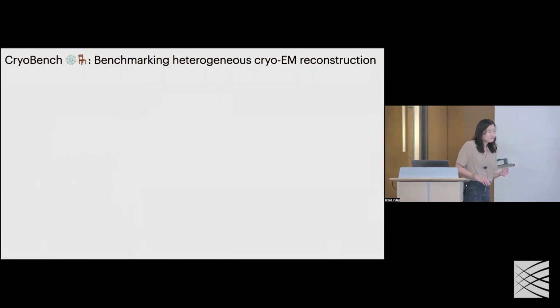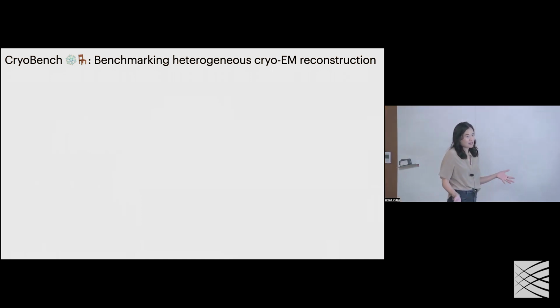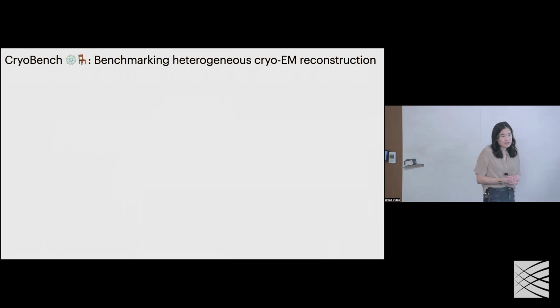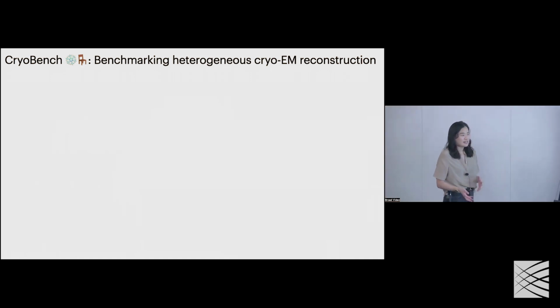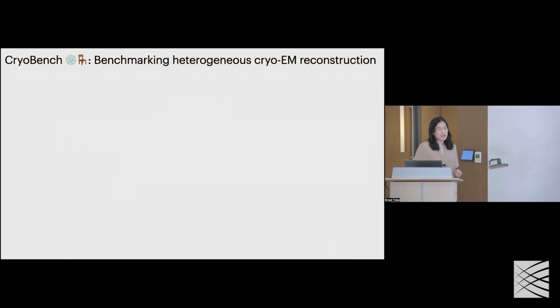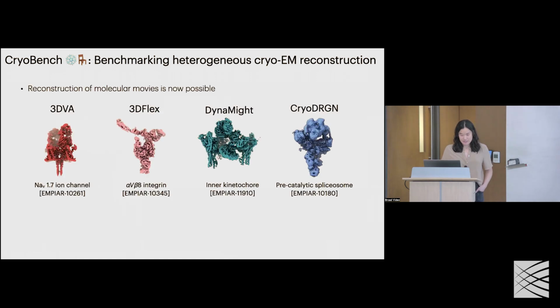data. And so that led to this project on benchmarking, right? So now with these large protein generative models, maybe with some of these other reconstruction methods that use more opinionated forward models, how do we actually interpret the results, especially when we're considering heterogeneity?